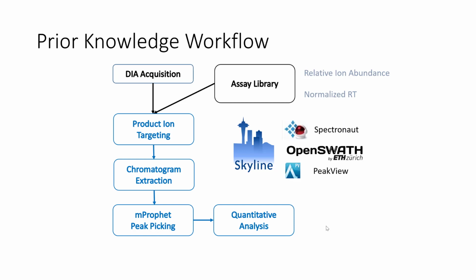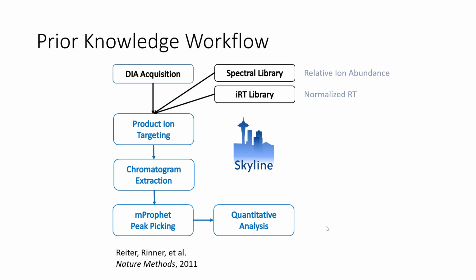So these are the two workflows that you need to remember. We're basically just walking you around this many times and showing you how to get through this workflow. But generally, I would recommend that you get really comfortable with this part.